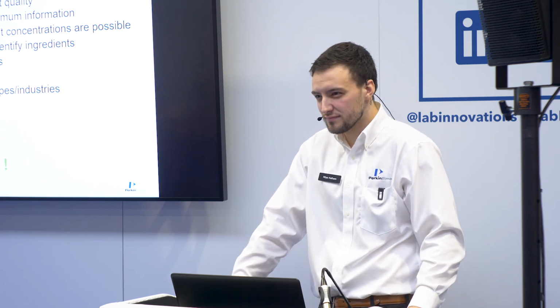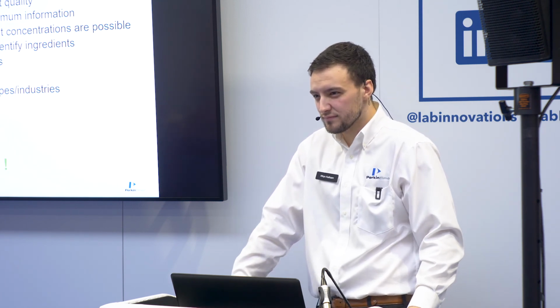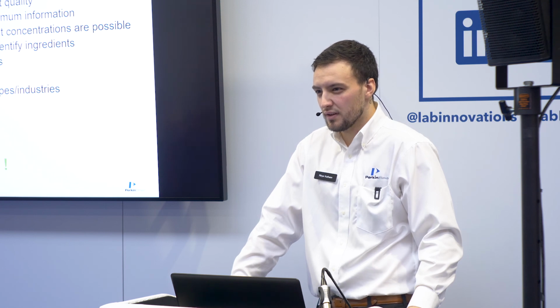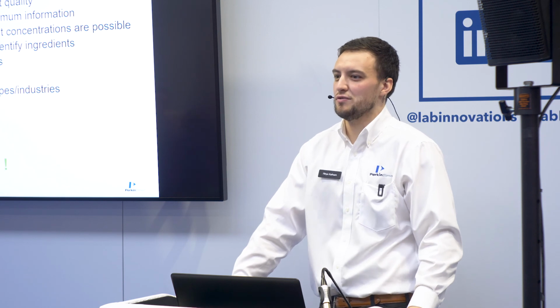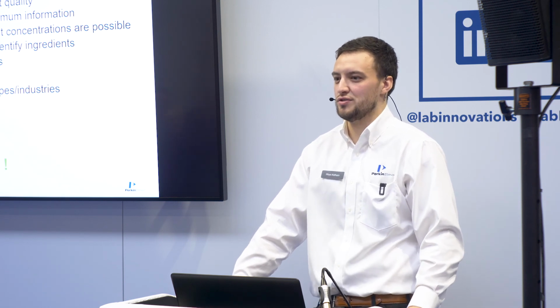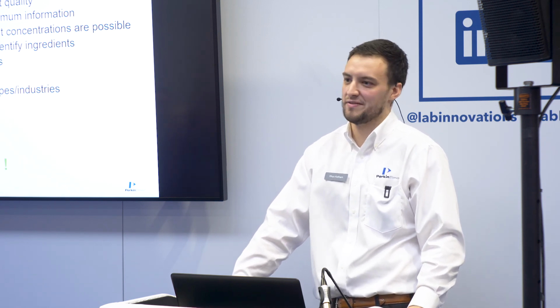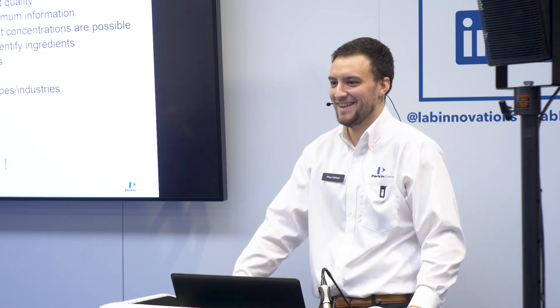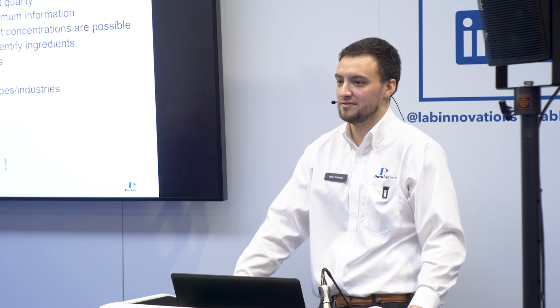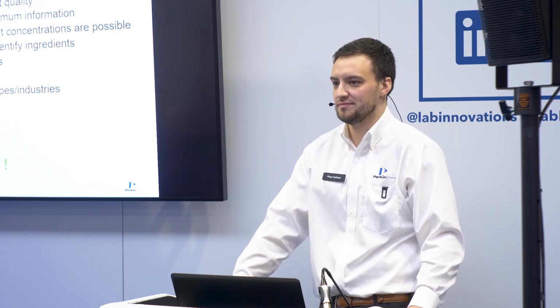Okay. What if the surface was, let's say, a glass fibre filter? Yeah. Rather than a solid tablet. Glass fibre filters you can usually do by transmission, but if you're doing mid-infrared, glass loves mid-infrared, so it'll just absorb it. So it's not the best. The near-infrared would be better, but yeah. So okay. There are ways around it. Okay, thank you.